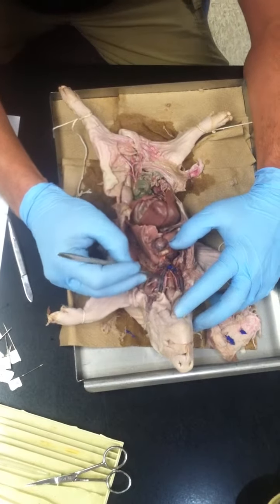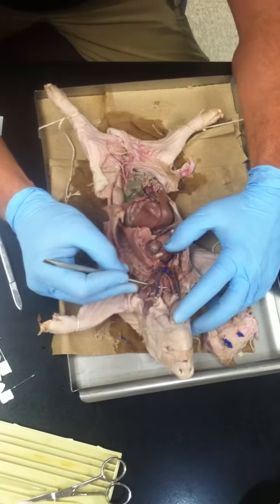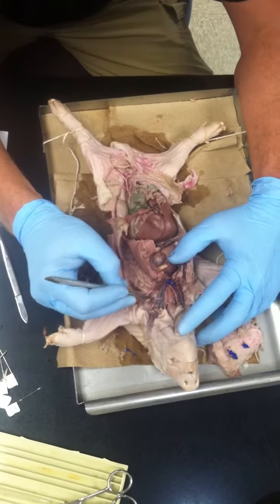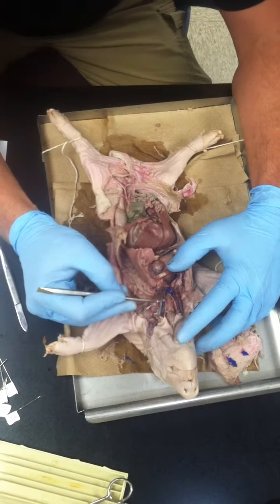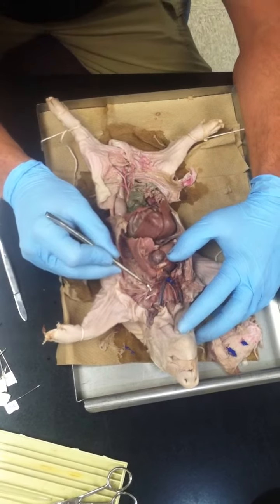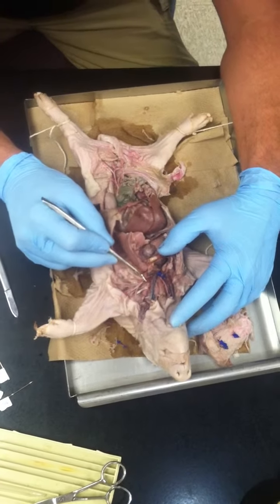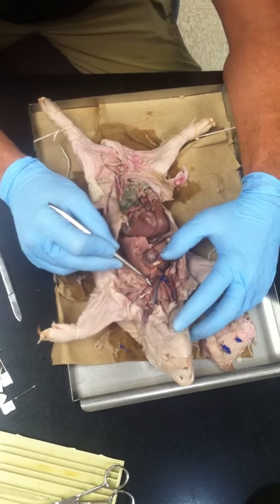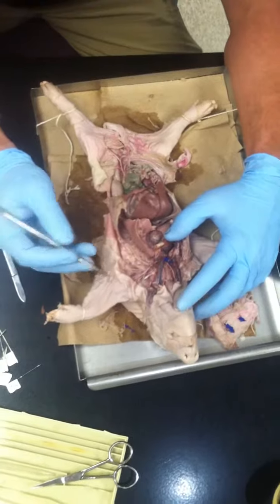Okay, first one, common carotid. We're doing them on the left side here. Common carotid. Internal jugular. External jugular. Cephalic. Subclavian. The axillary, artery, and vein.